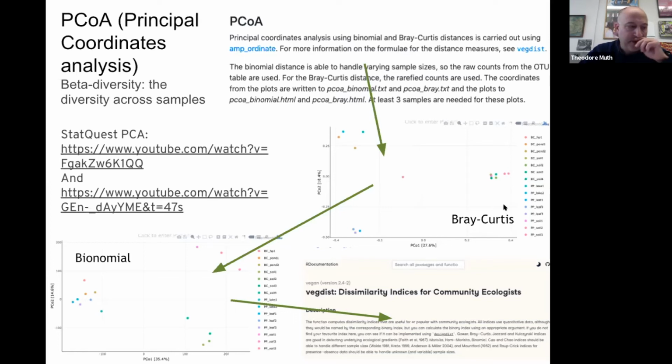Similar plots, and I don't think we'll have time to get to it today, but you also get PCoA plots out of the QIIME2 pipeline. They're also very nice. They're also three-dimensional, which is kind of cool, so you can go in that Z plane. And in there, you have the ability to change the sample groupings. If we don't get to it today, then I can show you in the third session. But yes, there is an option to do that for the output from the QIIME2 pipeline.